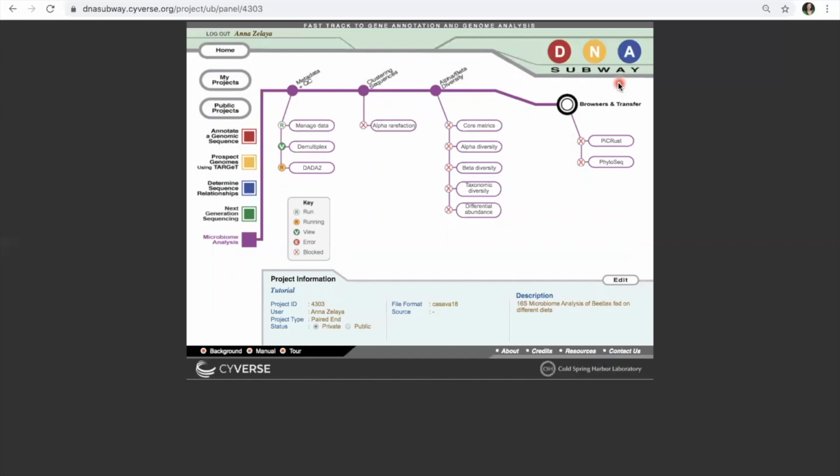We took that quality data and said, this is where we want to trim or truncate our reads. And now Dada2 is actually doing the truncating and the trimming. There are a lot of steps going on in this process, a lot of details that you don't necessarily need to know at this point, but this is why it takes such a long time. And as we can see here, there's the red R in the yellow circle, the process is running. So go ahead and just close out.